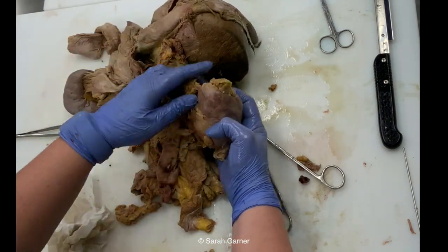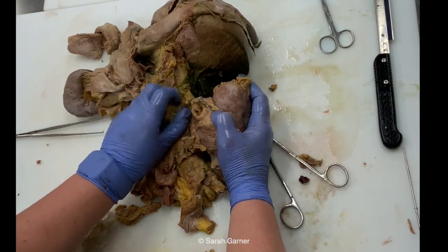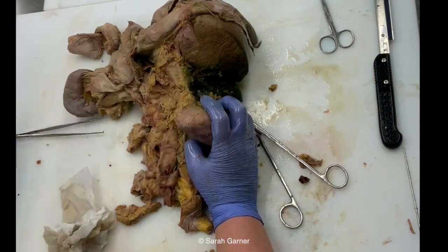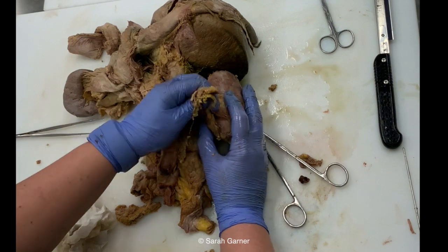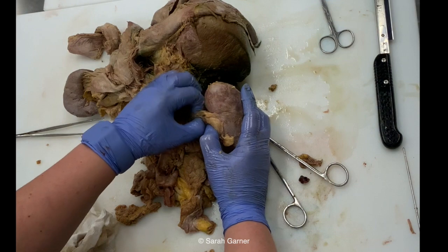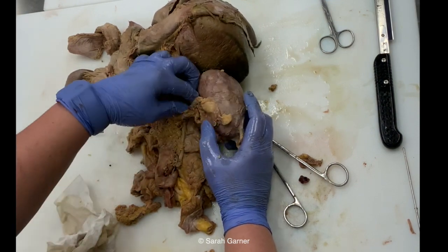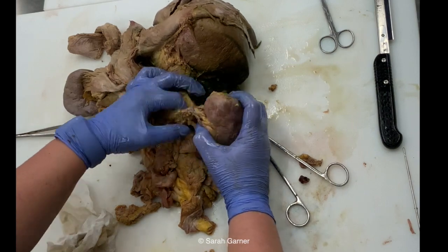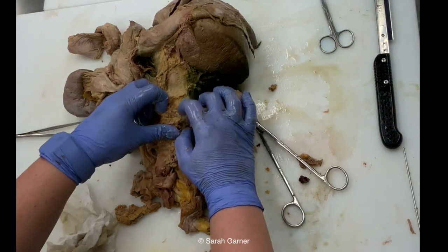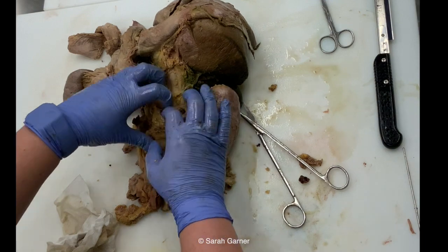So now here's our kidney. And again, you just want to get those vessels and that ureter nice and clear so that we can cut them nicely. I don't want to just pack everything out. That is, in my opinion, a poor examination of organs. And in each of these cases, you have to remember, it is a patient, and it is a patient probably with family and loved ones that are depending on you and this dissection to come up with a diagnosis to understand why their loved one died. So it's not just cutting organs.